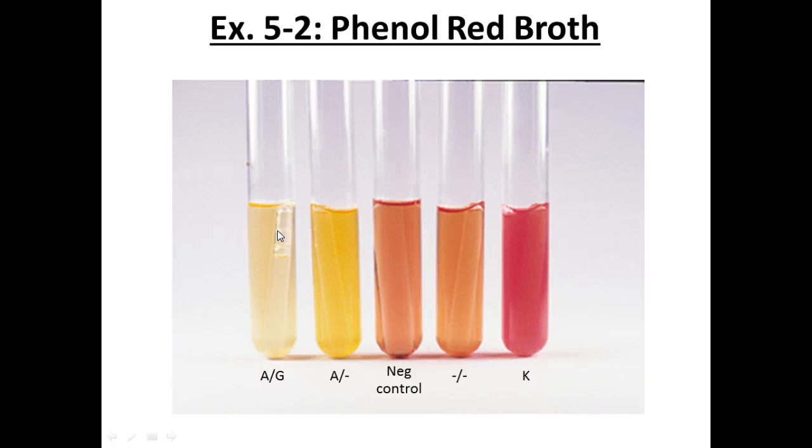So make sure you draw those on your report as well. Draw in your tube, draw in your bubble, or draw in your tube and no bubble if you don't have a bubble. Now, some of us are getting a tiny artifactual bubble. Not unless it's a significant size bubble do you record it as gas. So compare it to our control racks that I have for you. If you have any question, let me know. Yours is definitely a bubble. I'm talking about tiny bubbles. Don't be looking for microscopic bubbles. If it's a significant bubble, you will see it. There's no question.